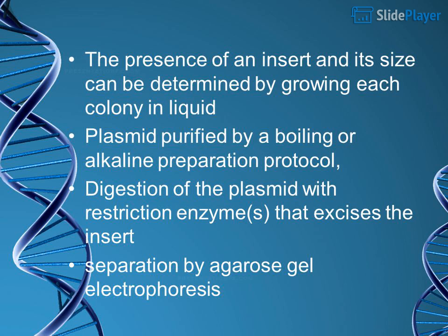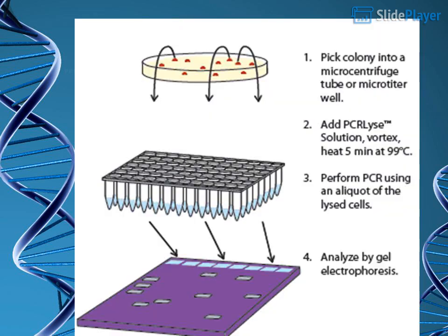Plasmid purified by boiling or alkaline preparation protocol. Digestion of the plasmid with restriction enzymes that excise the insert. Separation by agarose gel electrophoresis.